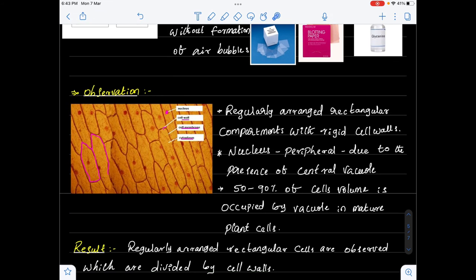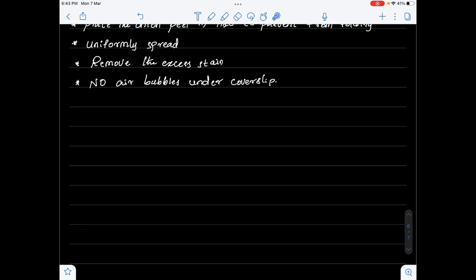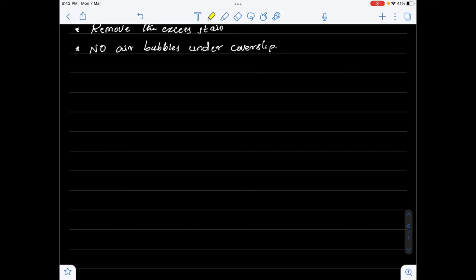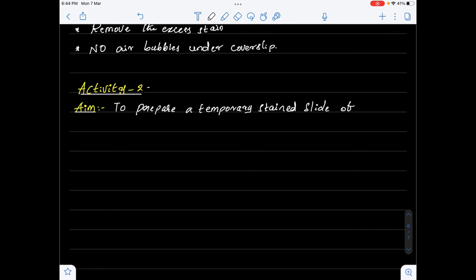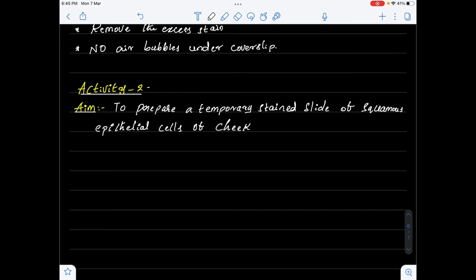Now let us do activity 2 — observation of human cheek cells under compound microscope. The aim of this activity is to prepare a temporary stained slide of squamous epithelial cells of the cheek of man. The materials required to perform this activity are as follows.